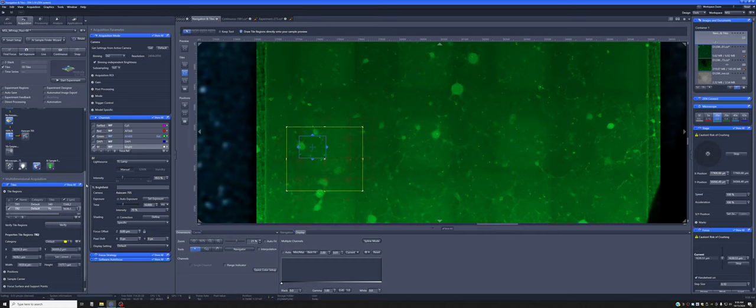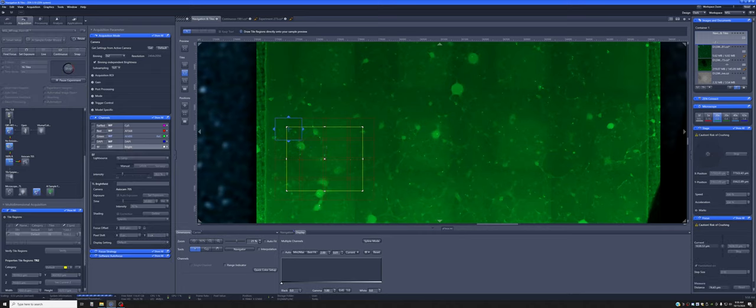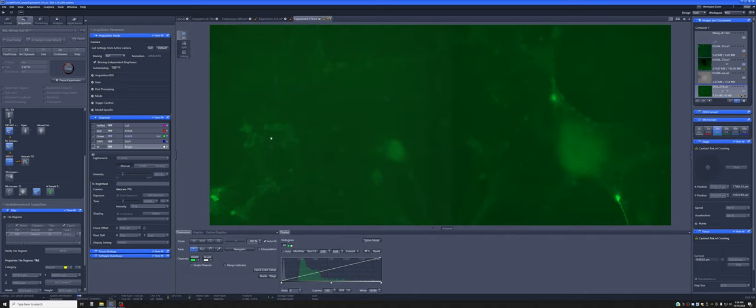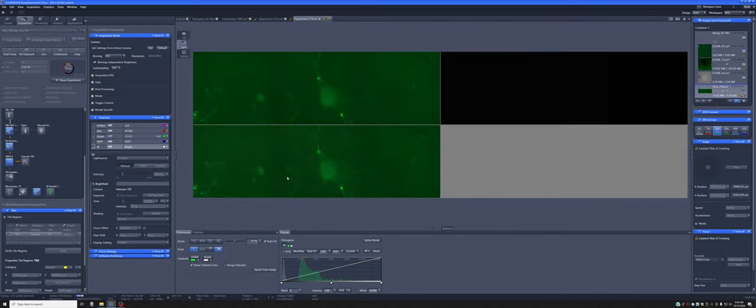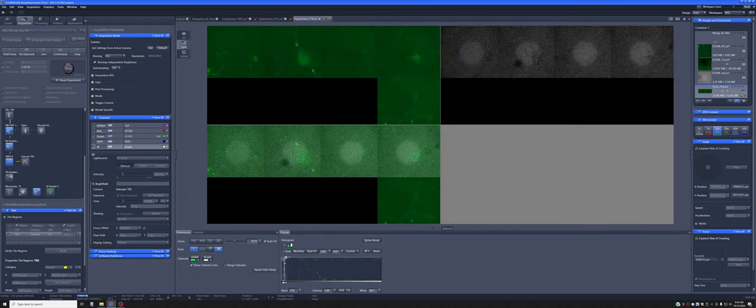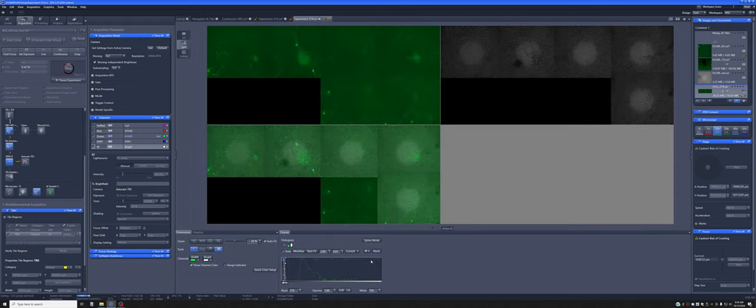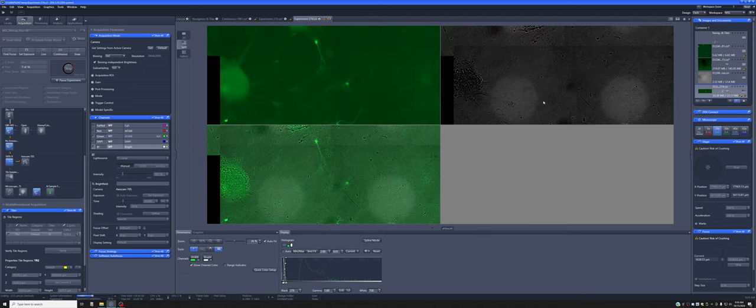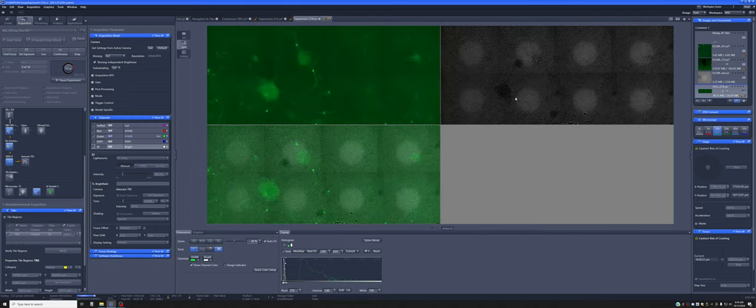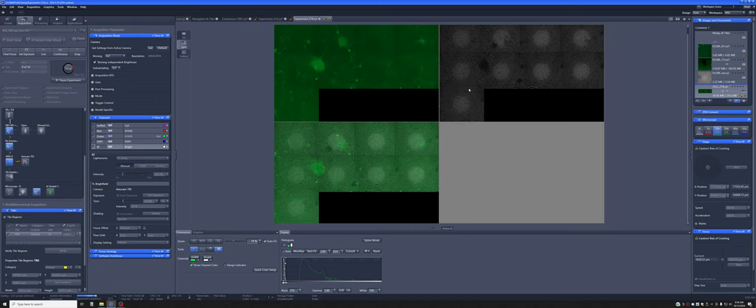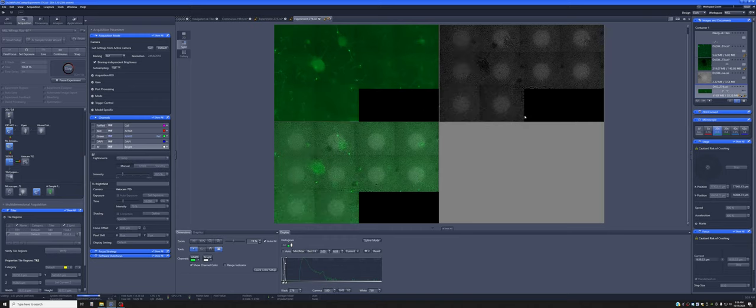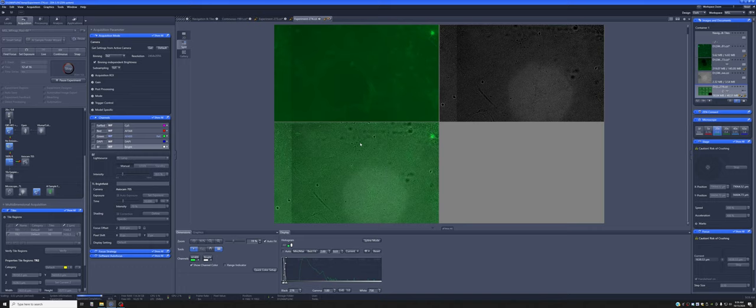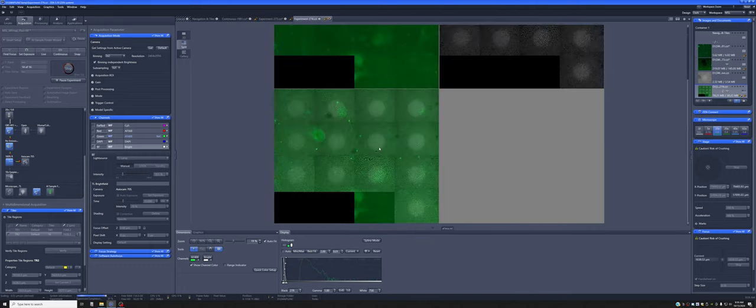All right. Let's see. Okay. So let's try that. And this will be a two channel. I'm not sure what this reflection is, but you know, by the time you actually are on the microscope, we may have solved that. But you can see fluorescence in one channel, the brightfield in the other. And this can be useful again for you to sort of find your way around.